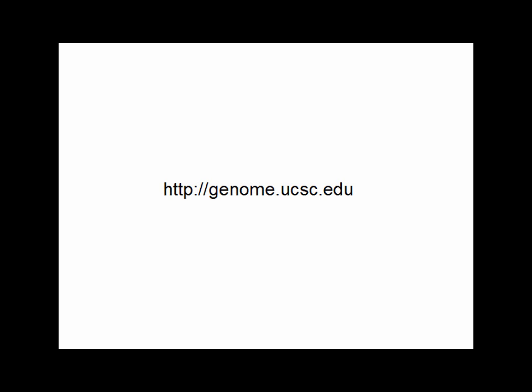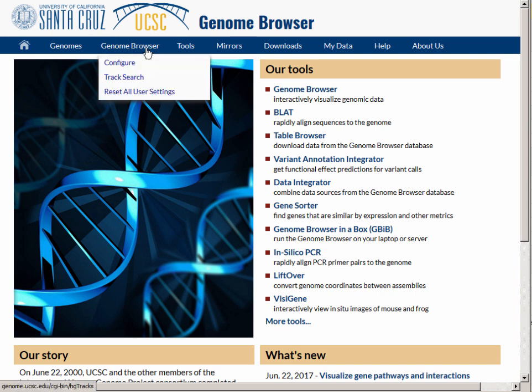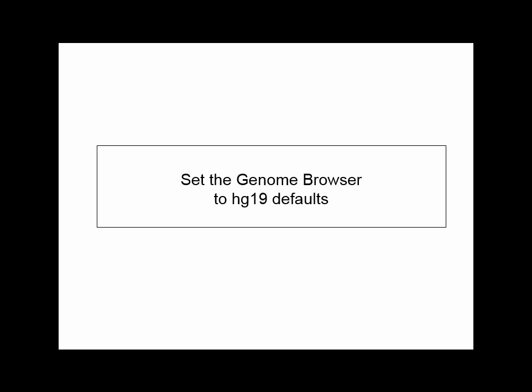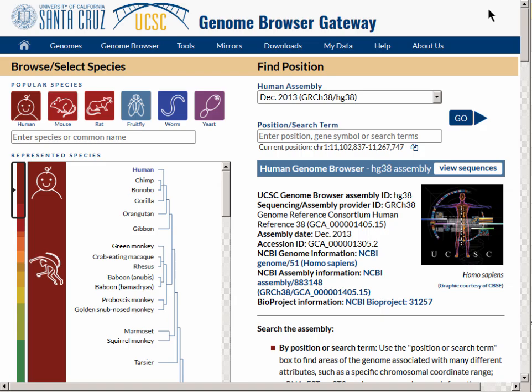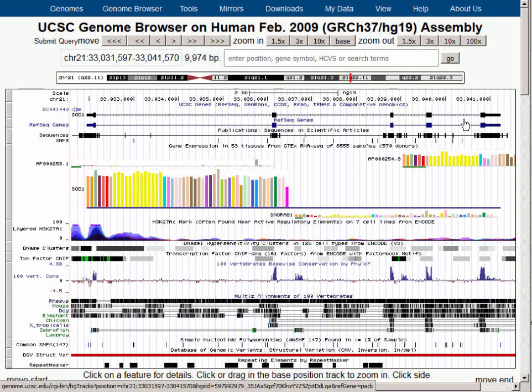You can see that there's a link to the tool directly on the main page at genome.ucsc.edu. Let's go to the Genome Browser and reset all user settings, because to use the in-silico PCR tool we must first have some primers to input into the tool, and we will navigate to the Genome Browser to find them. Let's go to the HG19 assembly, as that's still the most commonly used human assembly, and use the Go button to navigate directly to the Genome Browser graphic.